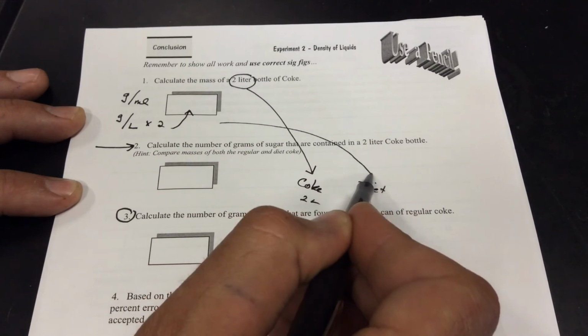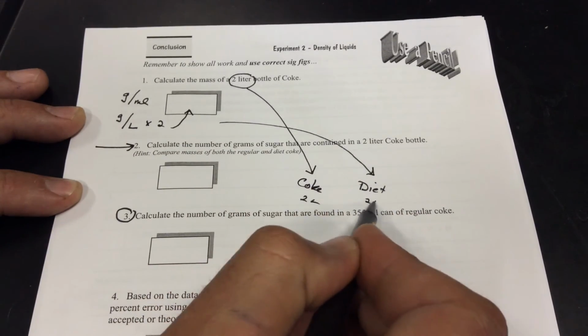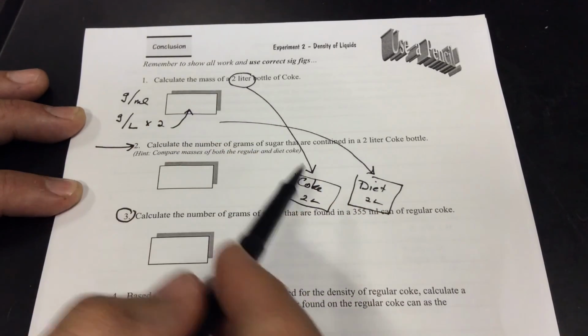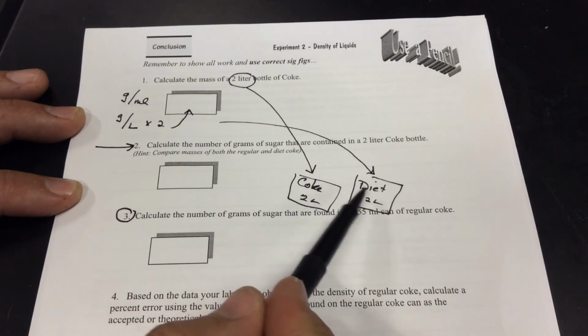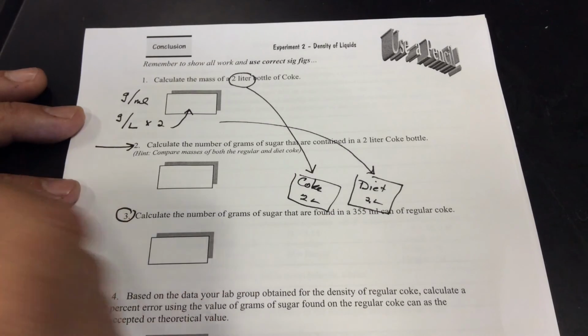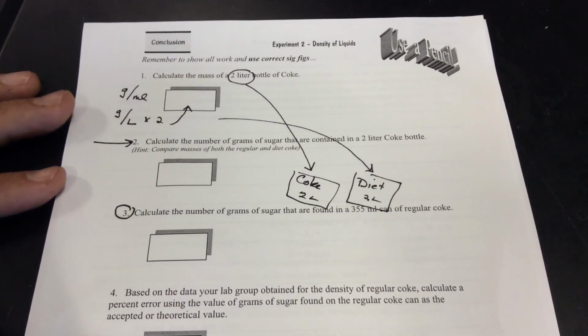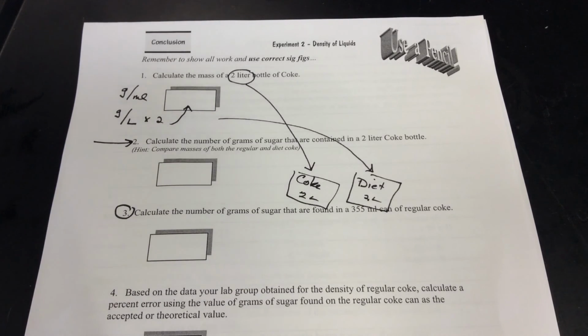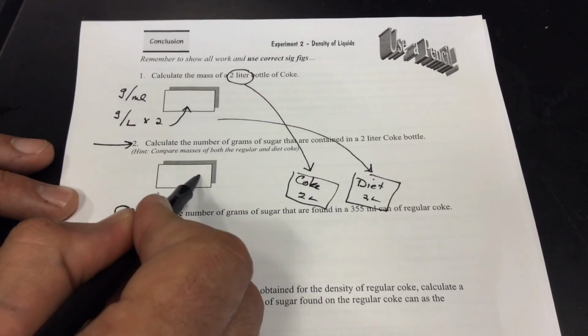And then what do I do with these 2-liter masses? Right? One has sugar, one doesn't. How are we going to find the difference? Okay. And now you have the grams of sugar in a 2-liter Coke bottle. Again, with the assumption that the ingredients are the same. Now, this is going to give you grams of sugar.